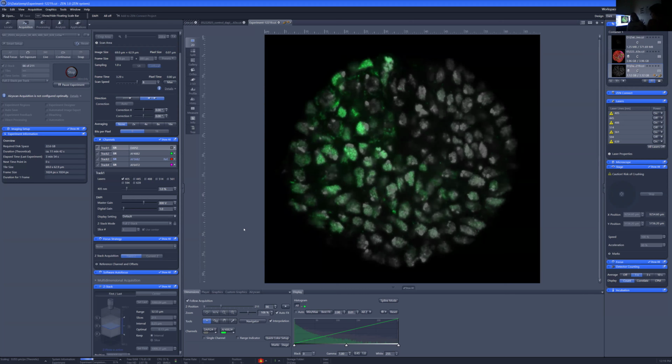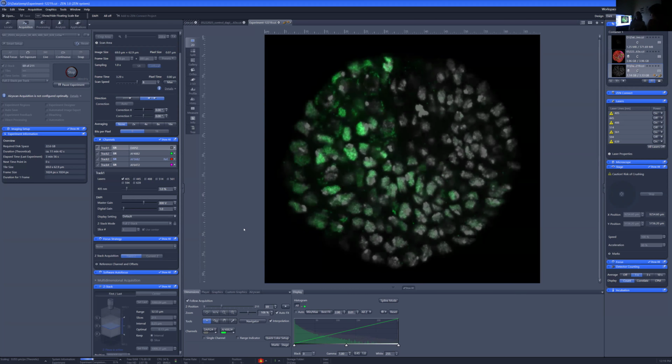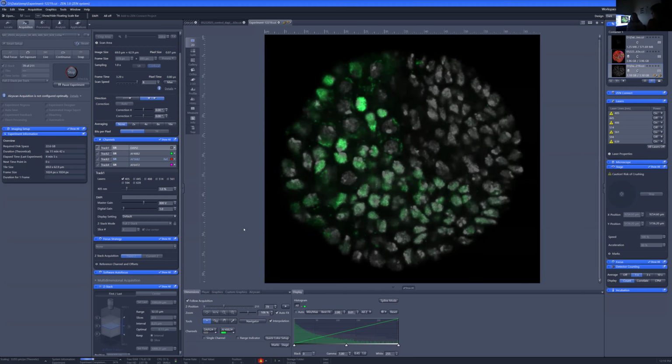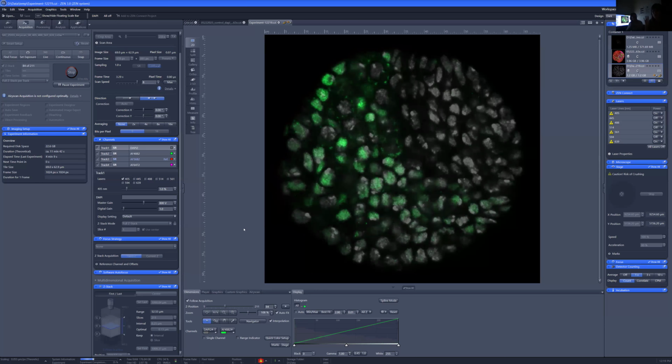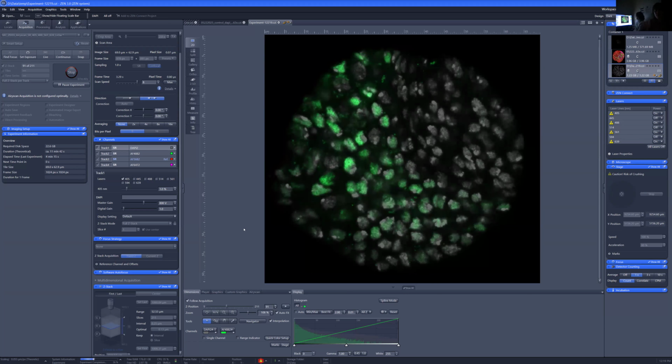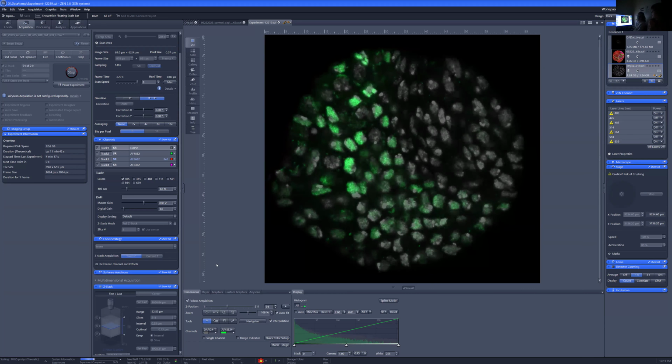There's some justification for that from other scientific fields, but I want to start to do some of those experiments in my tissue to see if that contributes. And stuff like that is precisely where a fly organ is a great system to interrogate this in, because these issues of tension are really hard to artificially reproduce.